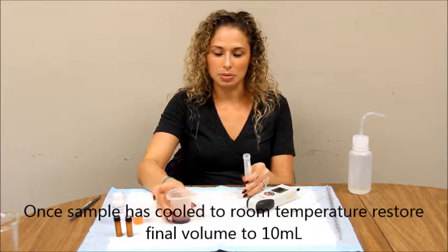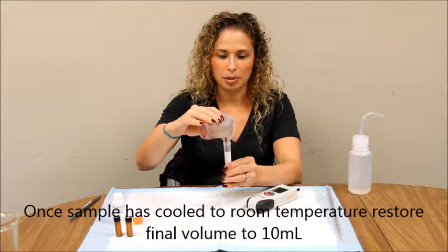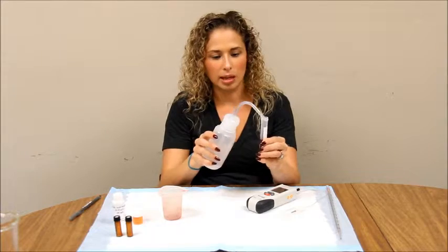The sample will lose volume, so bring the volume back up to 10ml by pouring the sample into your 15ml conical tube and replacing the volume with DI water.